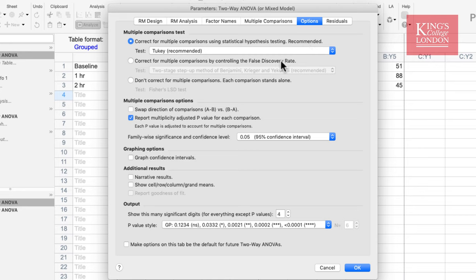We also have options for multiple comparisons with false discovery rate, or not to correct for multiple comparisons. Below, there are some other options which you may want to take some time to read through. One nice option is the production of some narrative results — we'll select that and see the outcome shortly. Finally, you can choose whether you want to create some graphs showing your residuals. We are happy with the choices we have made and we're going to click on the OK button.